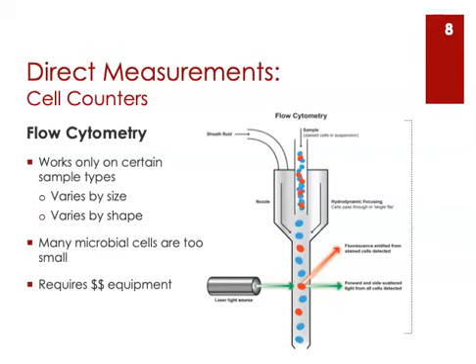But you do find flow cytometers in certain laboratories that are trying to do certain types of cell counting. A good example is laboratories that evaluate semen samples, sperm samples, for reproductive purposes. In veterinary medicine, we do a lot of flow cytometry when we are trying to count sperm numbers in breeding animal samples.